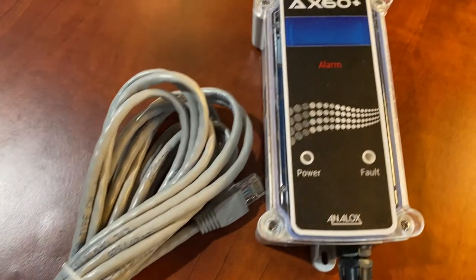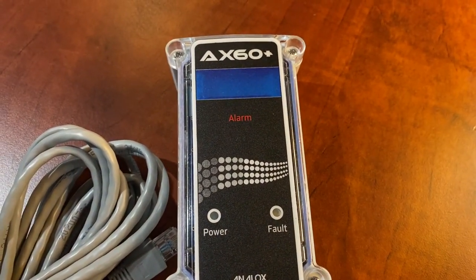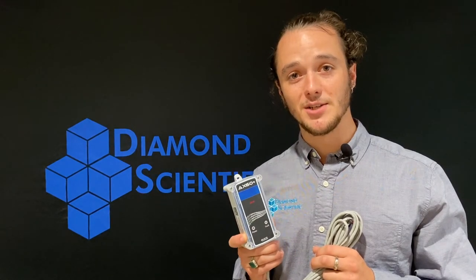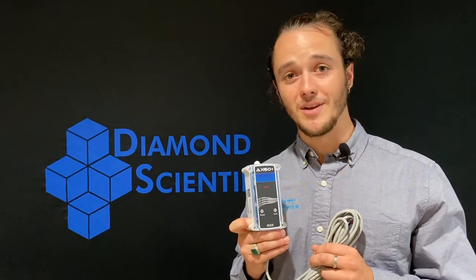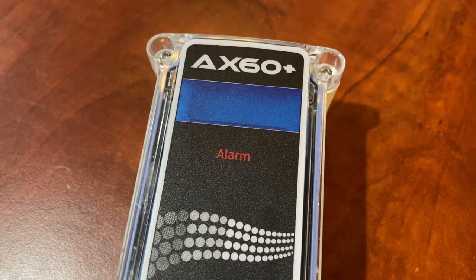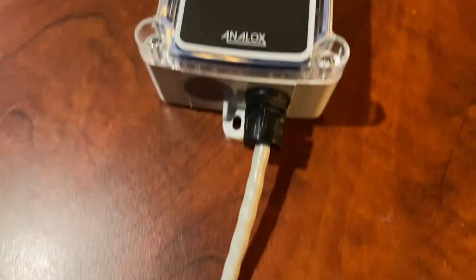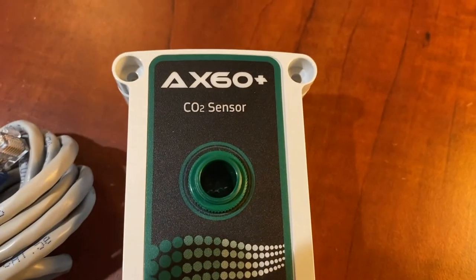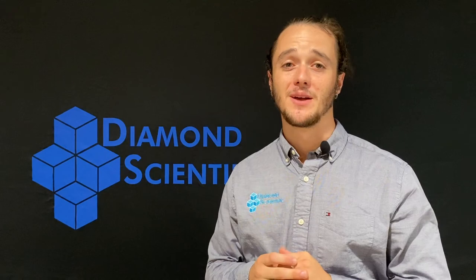The single alarm unit included in the AP1 package produces both an audible 80-decibel alarm and a blue visual strobing alarm. The alarm unit includes its own five-meter length of CAT5 cable, which is used to connect to the corresponding sensor. That wraps up the components included in our AP1 package.